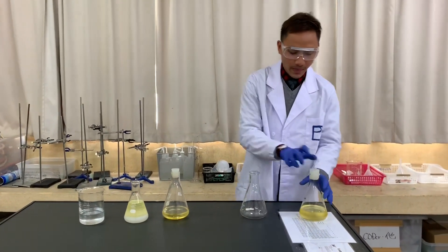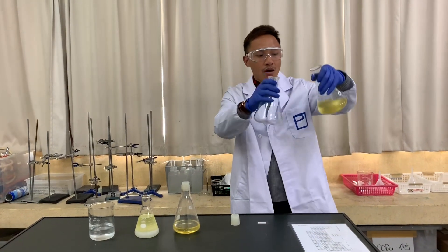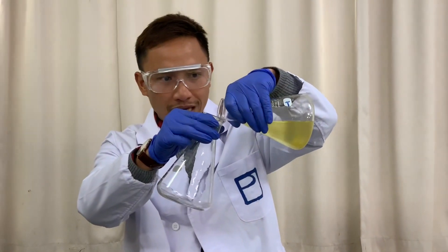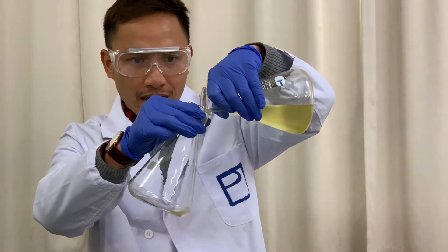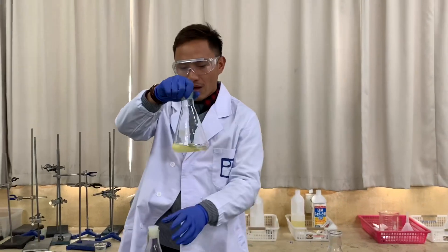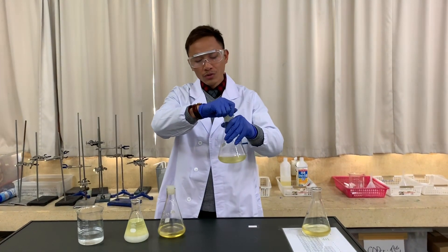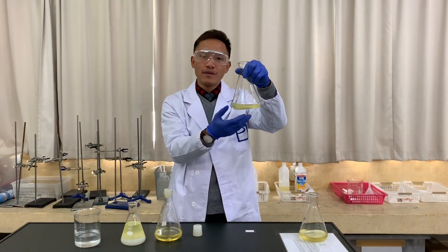Take another flask, open it up, and slowly decant. There are many ways of separating these two layers, but I'm going to use the easiest one — just decanting the upper layer, which is the biodiesel. Slowly and carefully transfer the upper layer. This biodiesel is crude; it's not very pure — we also have some unreacted methanol in it that we need to remove.